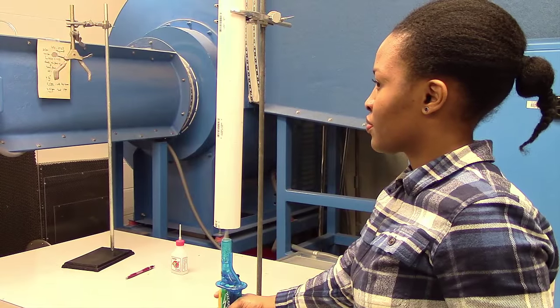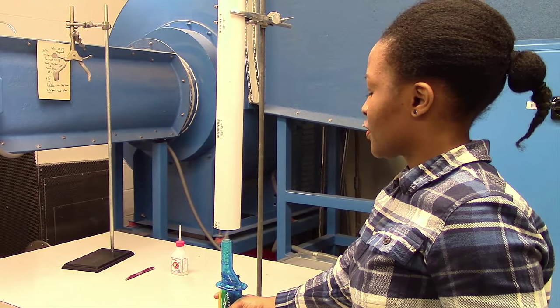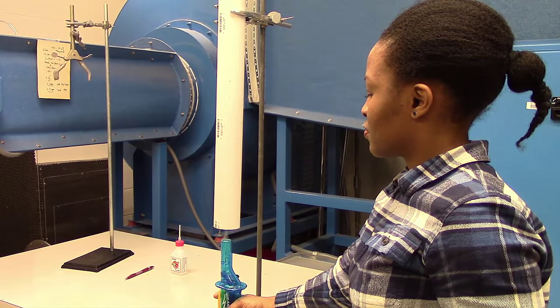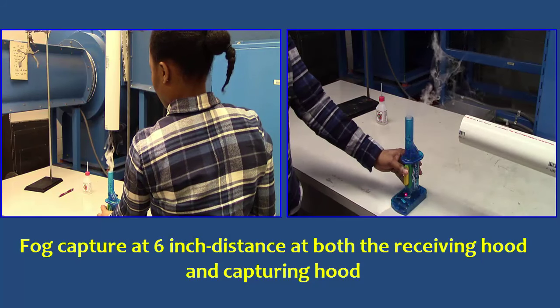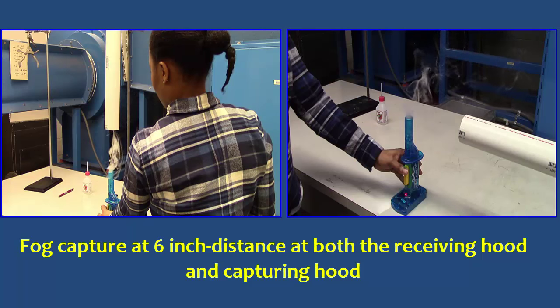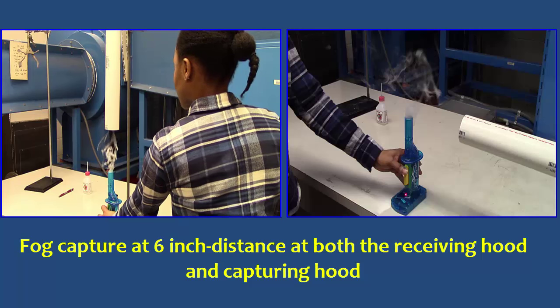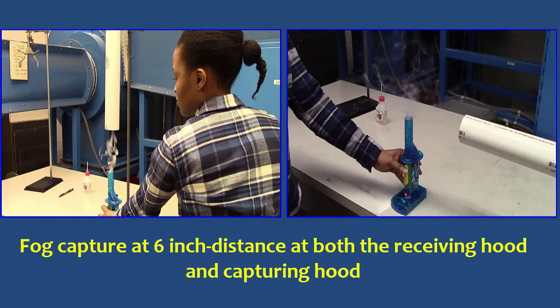For a vertical distance of two inches, all of the fog is also captured. We can see here that fog capture will improve as the source gets closer to the hood. However, the receiving hood is likely to capture all of the smoke at a longer distance than the capturing hood. This is because the receiving hood takes advantage of the energy or natural momentum of the contaminant. Since the momentum of the fog is moving upward, the receiving hood located above the wizard stick will capture the fog somewhat more effectively than the capturing hood located to the side.